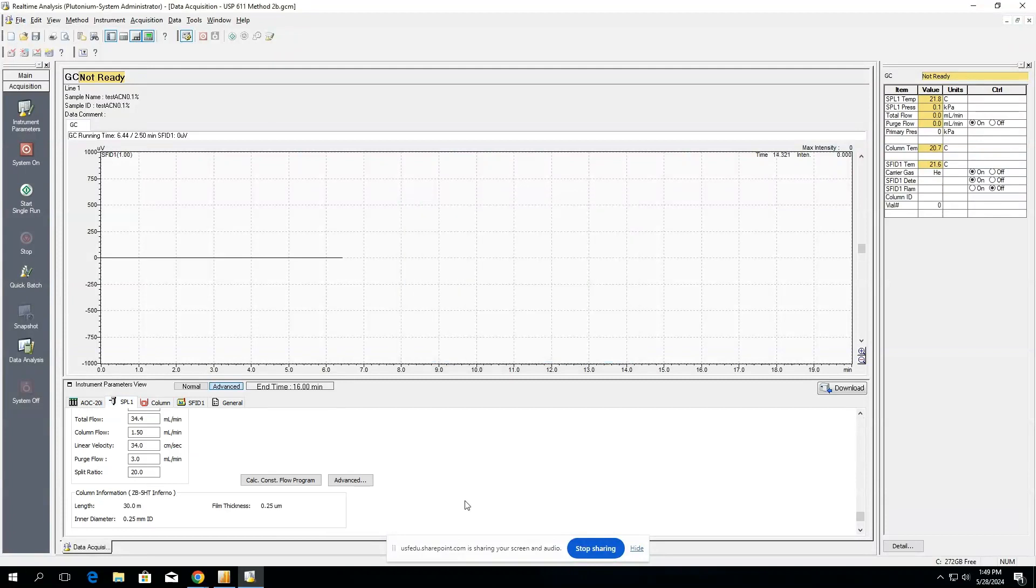When you're ready to go ahead and run your method, you can select download, and that will send this method to the instrument, and you will see all of these live parameters change.